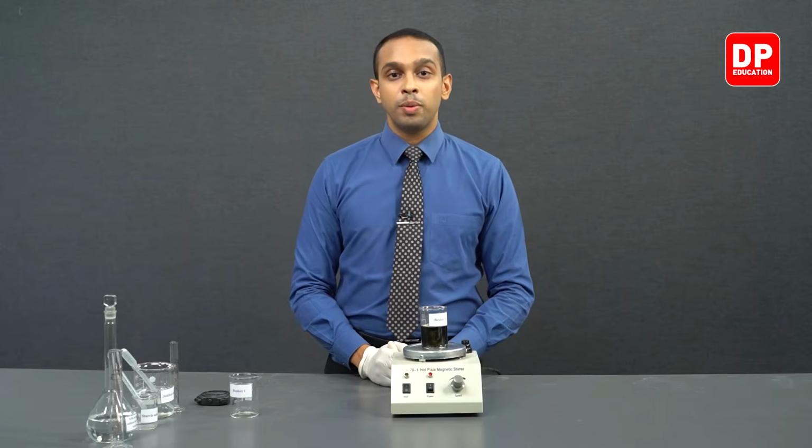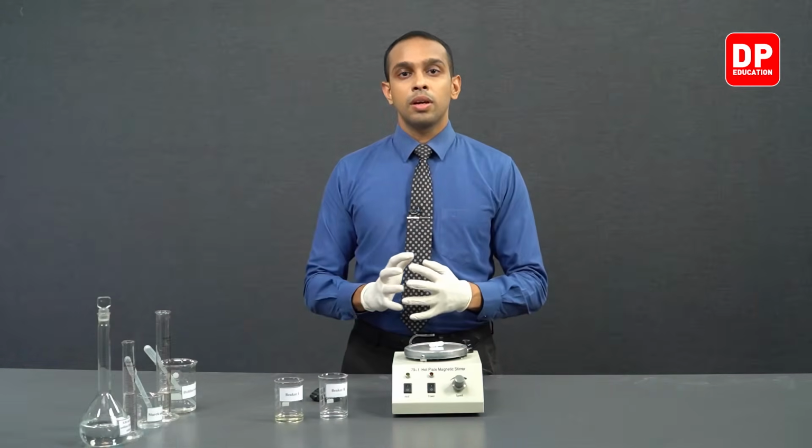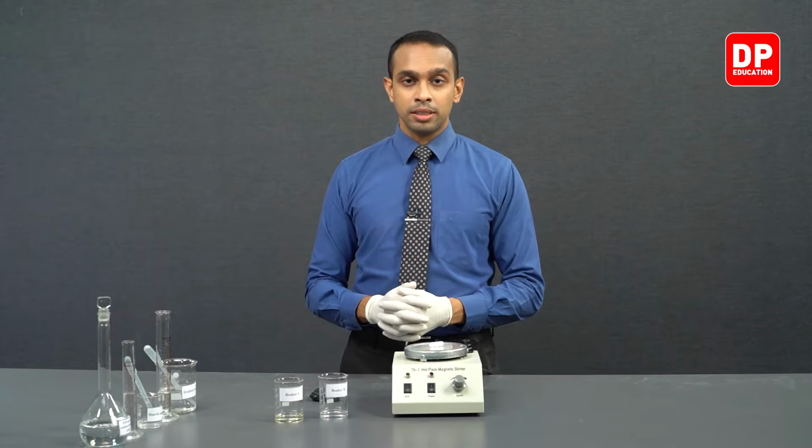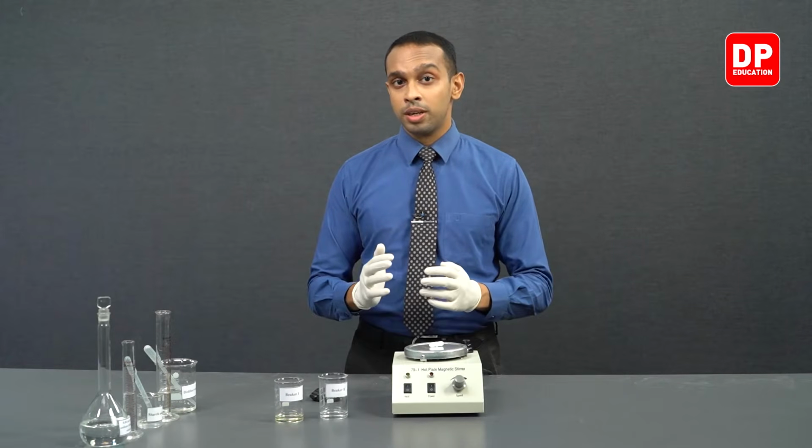Now students, we are going to be moving on to the fourth reaction. In the fourth reaction, we have decreased the volume of Fe3 plus ion solution.